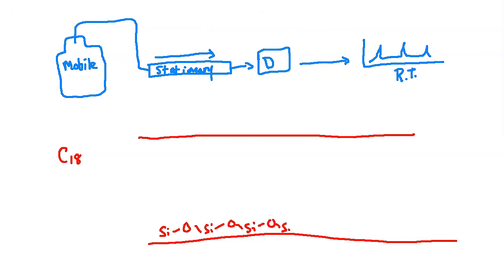Okay, now a lot of times when we do wet bench sort of desktop chromatography, we use silica gel, right, or alumina. So you have this as the base, and then once you have your silica gel, you can adhere other types of organic material to the side.